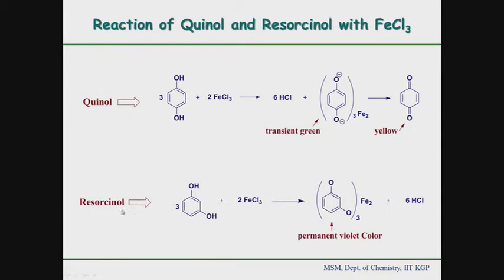For the second sample, resorcinol — this is actually 1,3-dihydroxybenzene. Take an aqueous solution of resorcinol and add ferric chloride drop by drop, one or two drops. You will observe a permanent violet color because of this complex, and this color is permanent. Unlike the transient green which lasts only a fraction of a second, for resorcinol you will observe a permanent violet color.